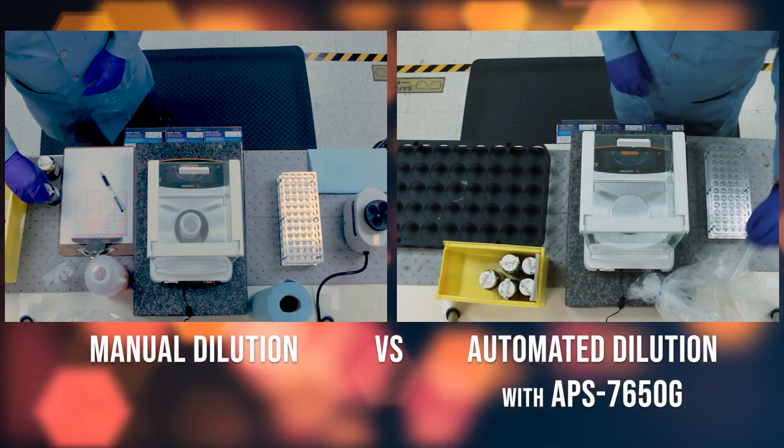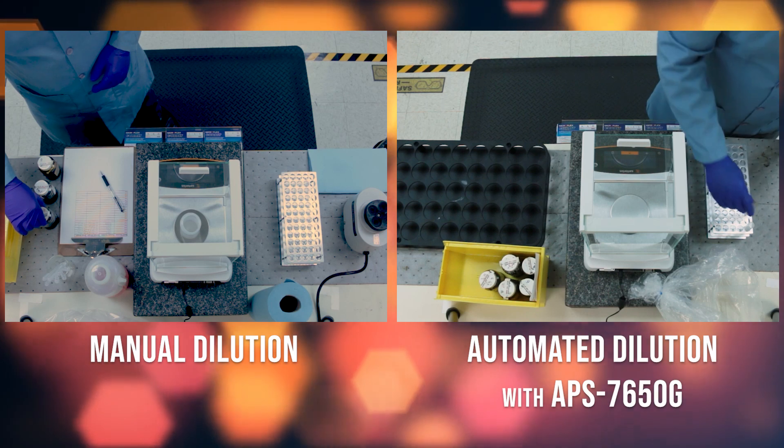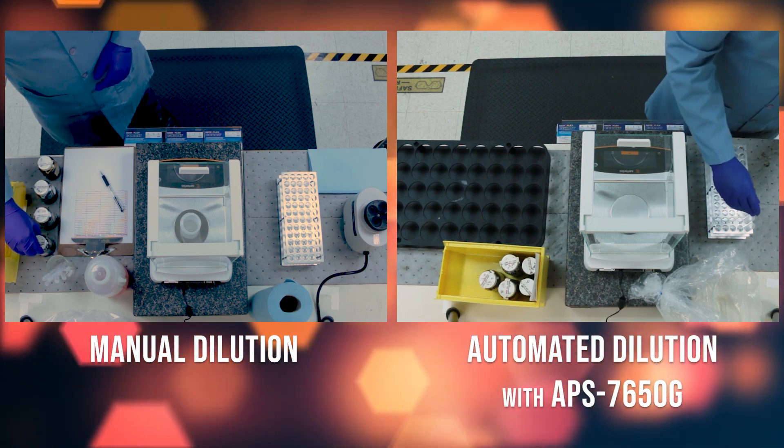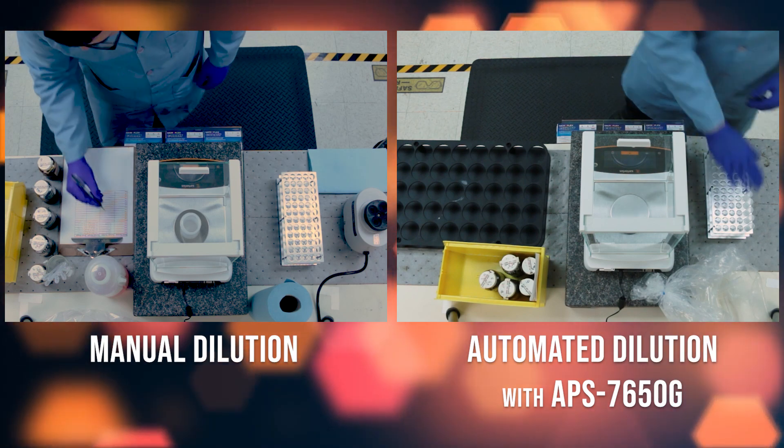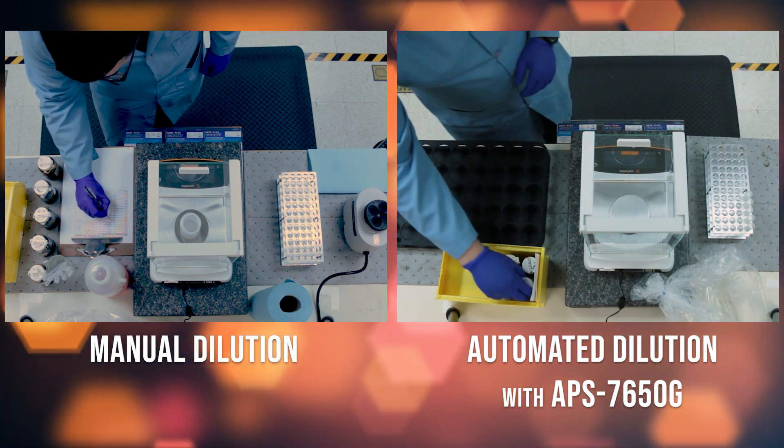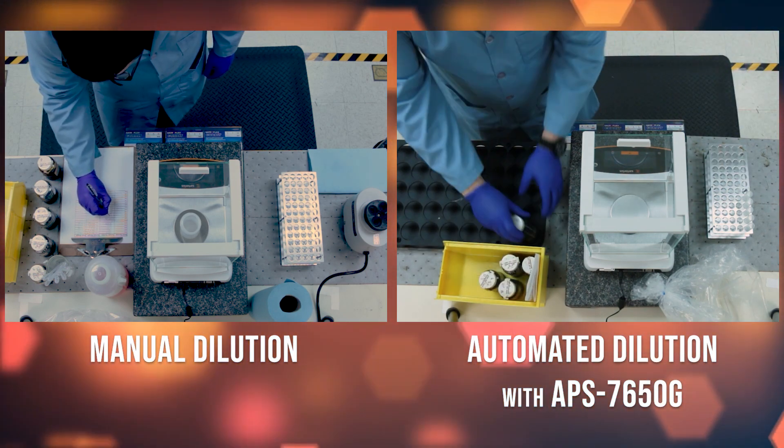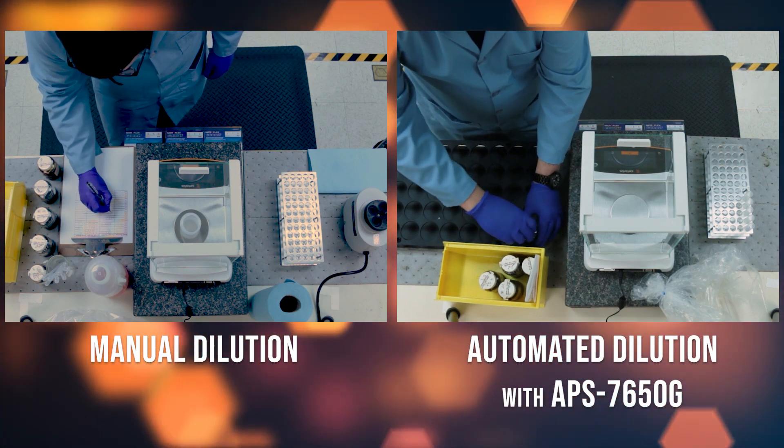On the left he's preparing them manually and on the right he has the APS 7650G Automated Gravimetric Sample Preparation. The idea here is that you'll get to see exactly how much time he saves even across a batch of only five samples.